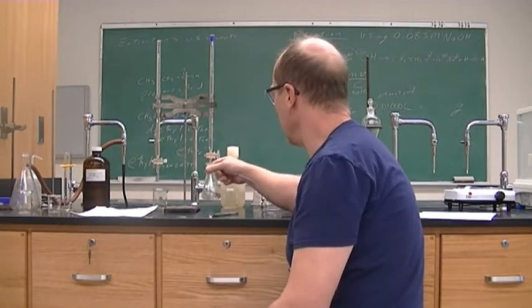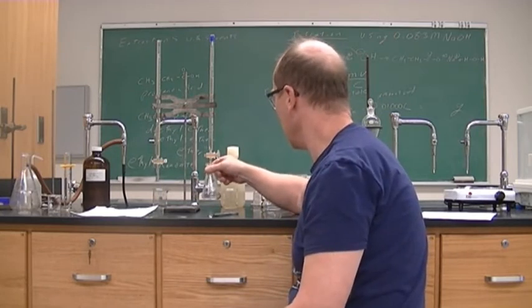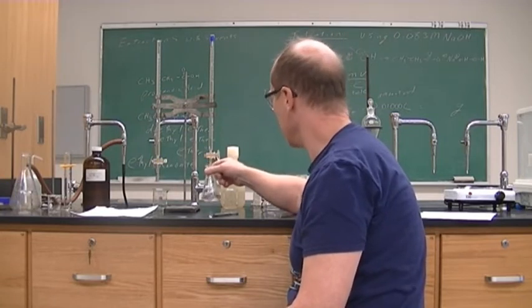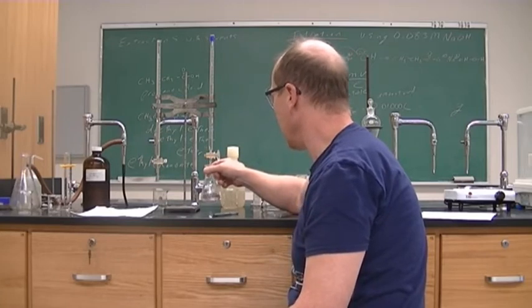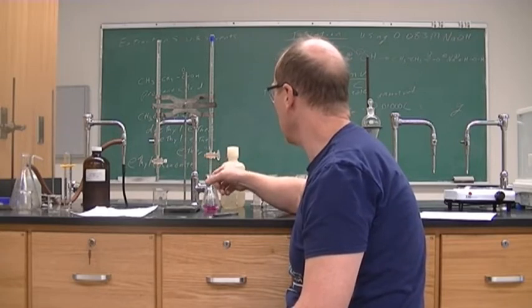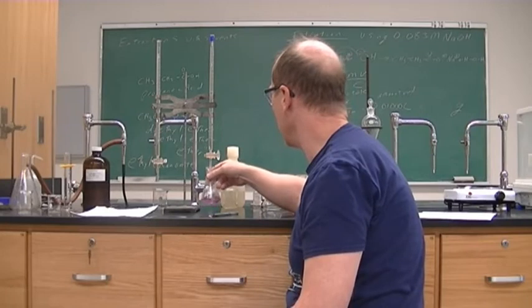All right, I keep saying that I'm going to get my magnetic stirrer out, but I keep not getting my magnetic stirrer out. So I will swirl this. So it hits, it's got the pink color, quickly disappears. When that pink color starts lingering longer and longer, I will slow down the drip rate. All right, so now it's lingering quite a bit, so I'm going to slow it down.